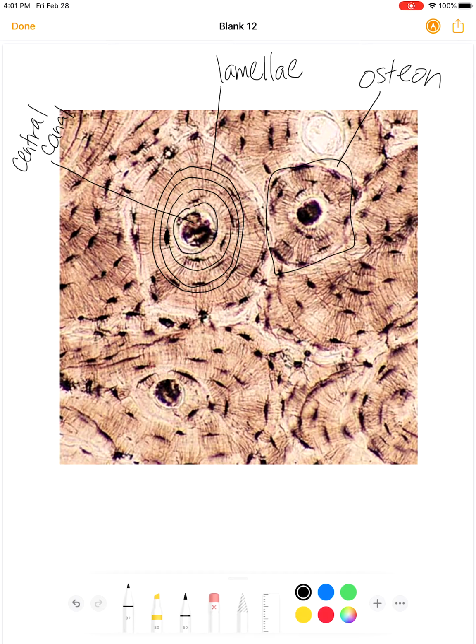Now, as you might notice, there are some dark spots. I'm going to highlight one right here. There are some dark spots scattered throughout this tissue. Those dark spots are called lacunae. And within the lacunae, you would actually see a mature bone cell. Let me just draw one right there inside of the lacunae, called an osteocyte. So osteocytes are mature bone cells, and they reside inside of the lacunae. Now, they don't become osteocytes until they become completely engulfed or enveloped by that bone matrix, or surrounded by the bone matrix.